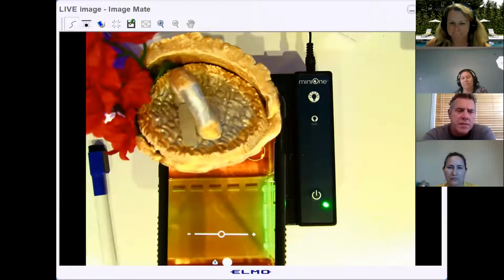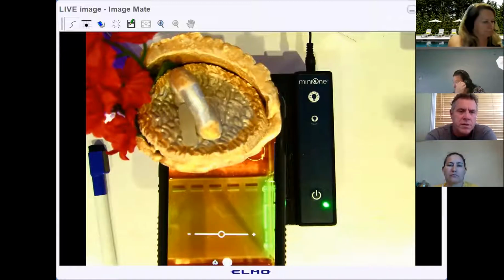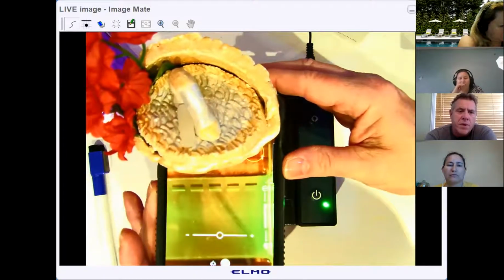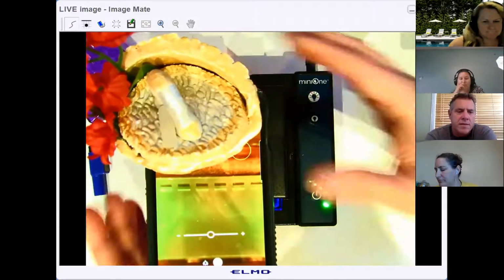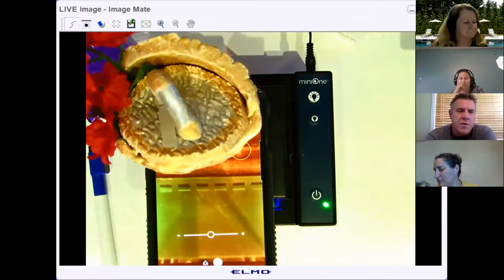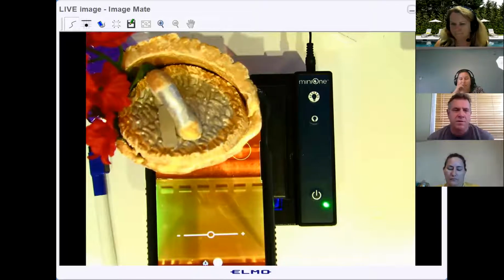Okay. We do a lot of practice with making a gel that has tons of combs in it and tons of holes and then giving it to people and having them practice loading just colored water so that they've got a lot of practice, because shaky hands with the micropipette tip just poke a lot of holes in the gel. And that was when you first are doing it with groups. If you're doing AP Bio, you're not doing a whole lot of this, but in biotech, you do it all year. They'll be poking holes in the bottom, which is a problem because then it leaks out all over.